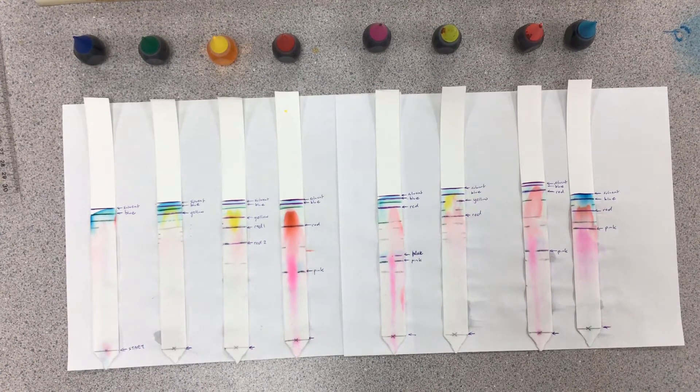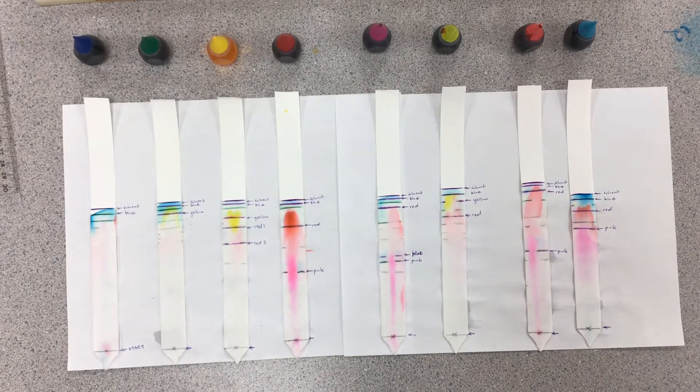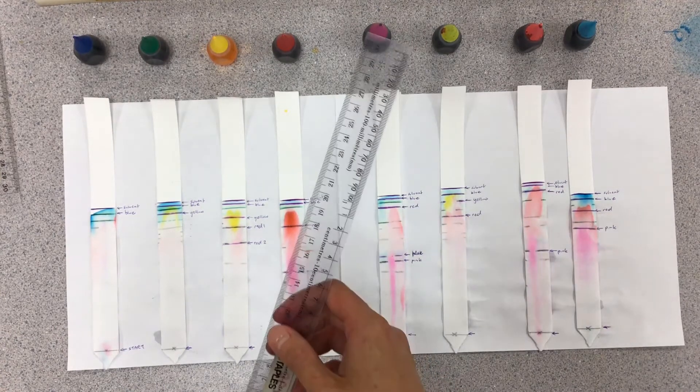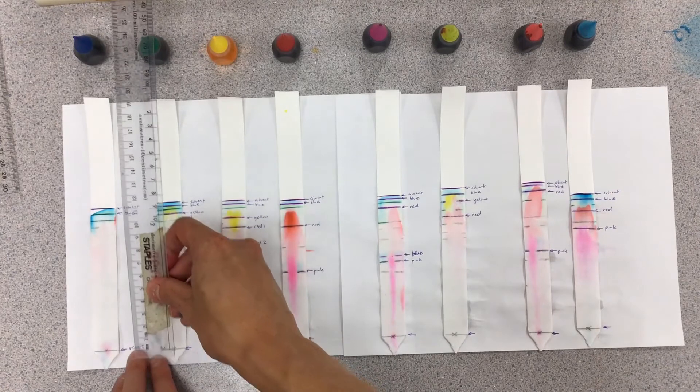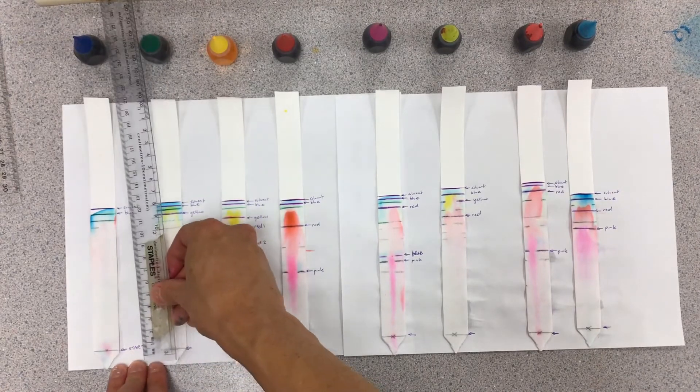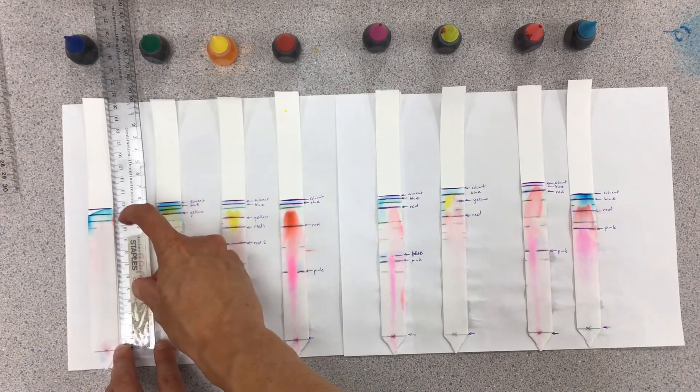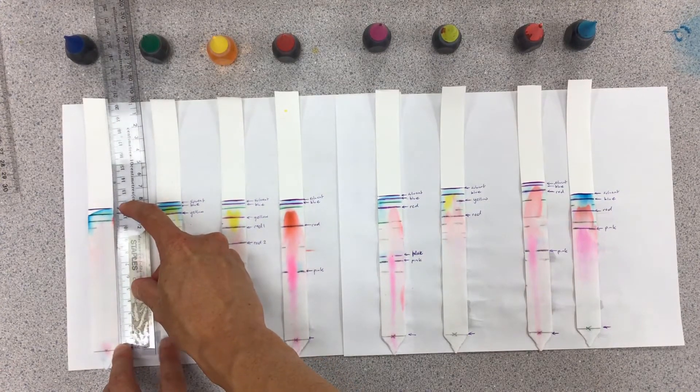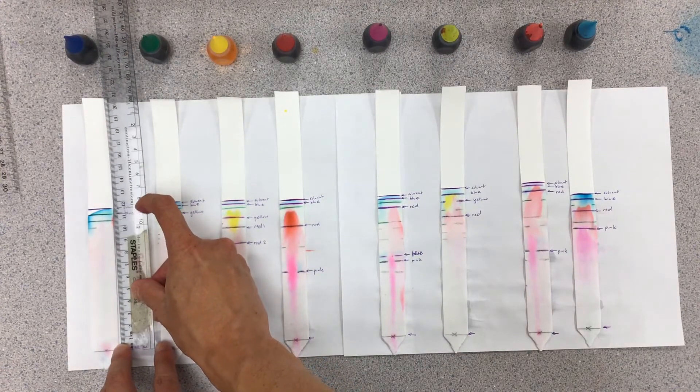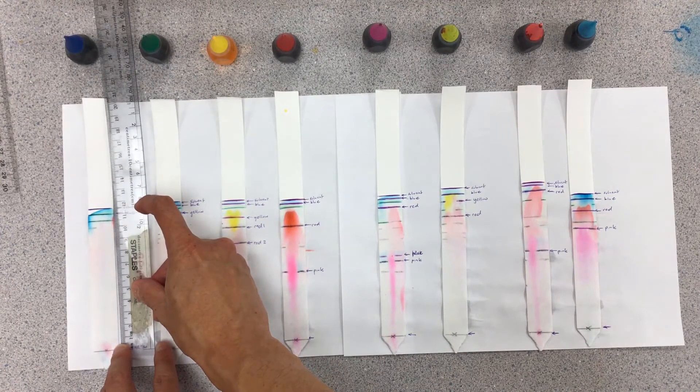We can calculate a value called an RF value. For the RF value, we just need to take two measurements of distance. I start off with this first one here, marking off the zero mark at the starting line. I measure the solvent to be roughly about 11.5, and then we compare how our solute is in comparison to that solvent.